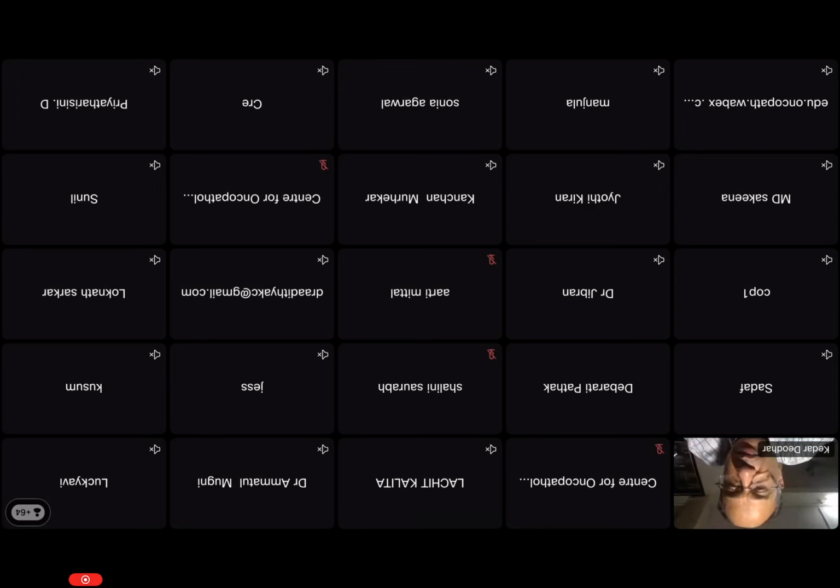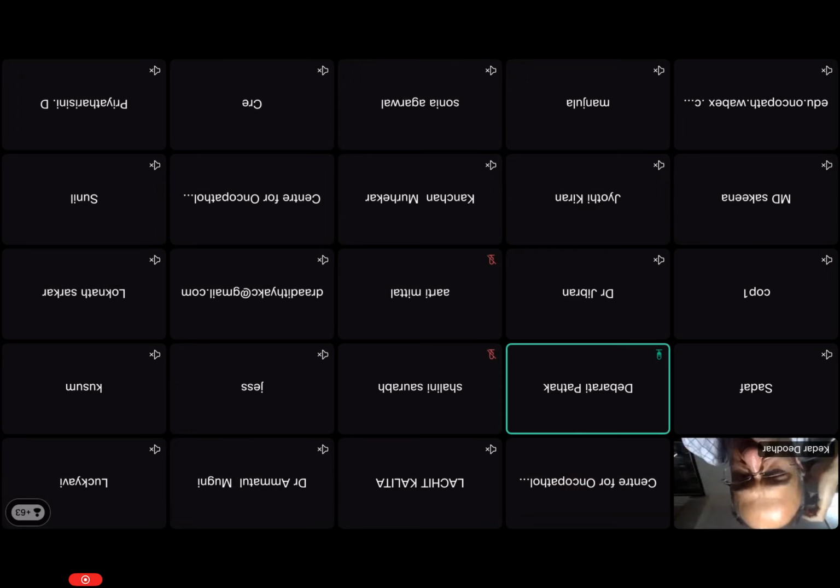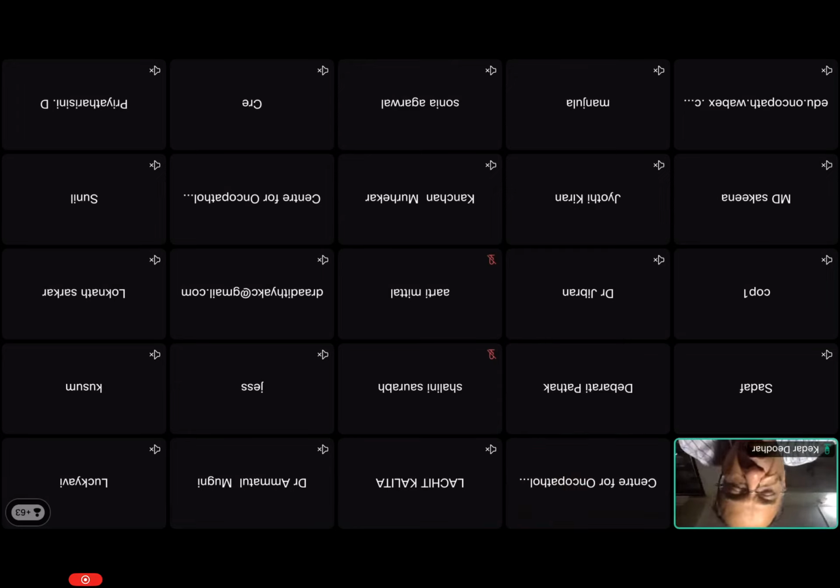How many sections should be taken in post-NACT cases? In which organ? How many minimum sections? Minimum should be 4. It's guided by the area of abnormality, but a minimum of 4 should be taken. And do not stop at 4 sections; do deep cuts to check whether there is a small focus of tumor cells lying in between any muscle coat or submucosa. But 6 will be a better number. Minimum 4 should be taken if you are calling no residual cancer.